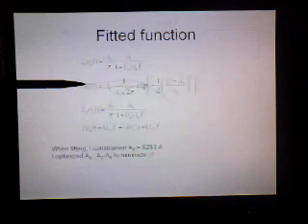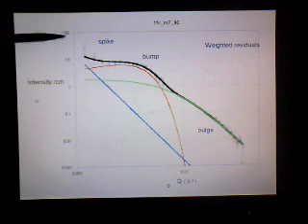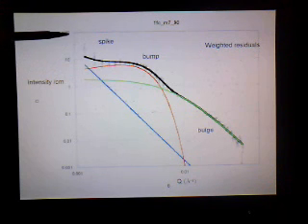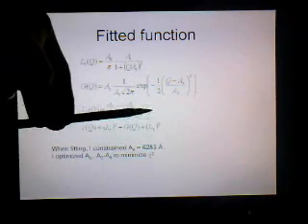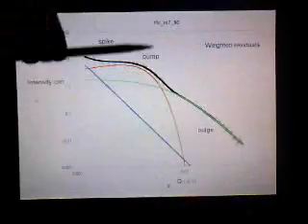What we're saying is that because we can't measure to small Q, we cannot measure the length scale associated with whatever scattering is giving rise to the domains that are giving rise to the scattering at small Q. Those are presumably very, very large domains. In the case of this function here, we are fitting that length scale, which roughly corresponds to 0.03, and that gives you a length scale of whatever domains contribute to the bulge.